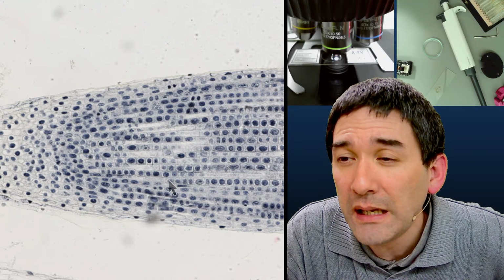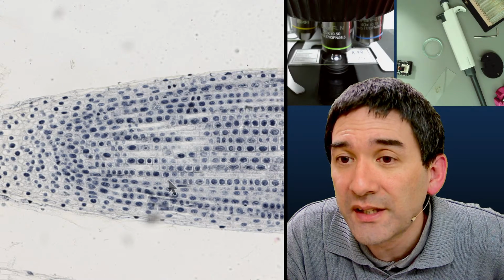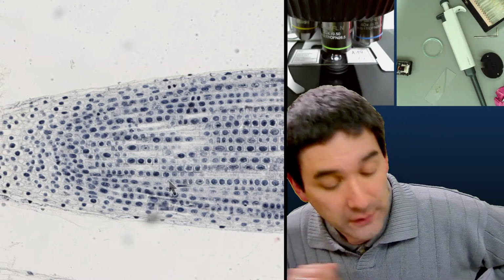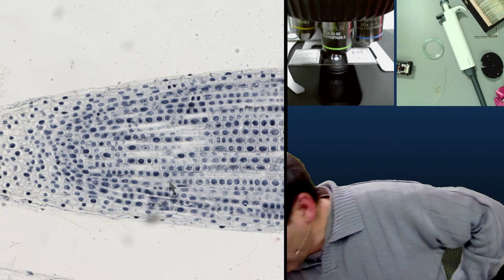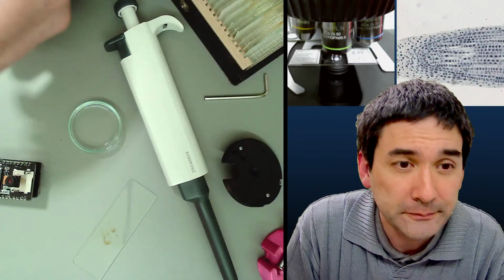I've been trying to make a dark field filter for my microscope and it does not work, no matter the size of the center I make. Any tip? I don't have dark field filters here now. So first of all, if you want to make your own, here's one. Okay, I'm just going to use this here as an example. It's a 3D printed one.